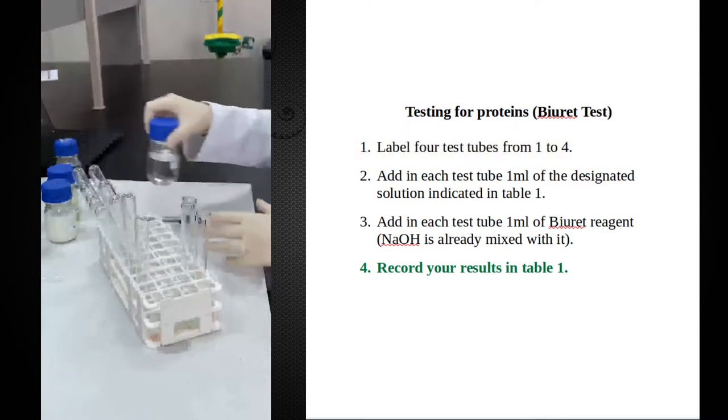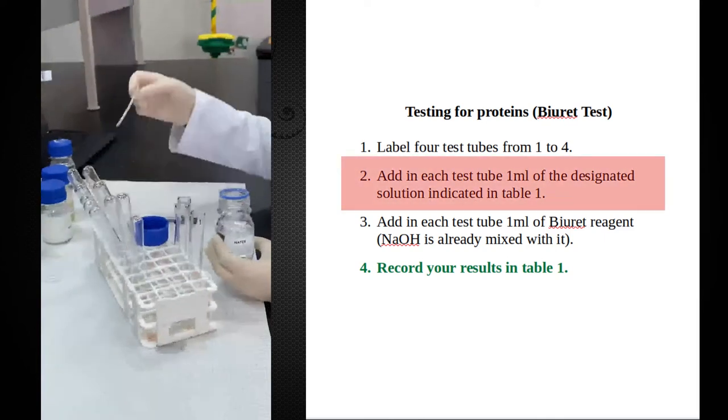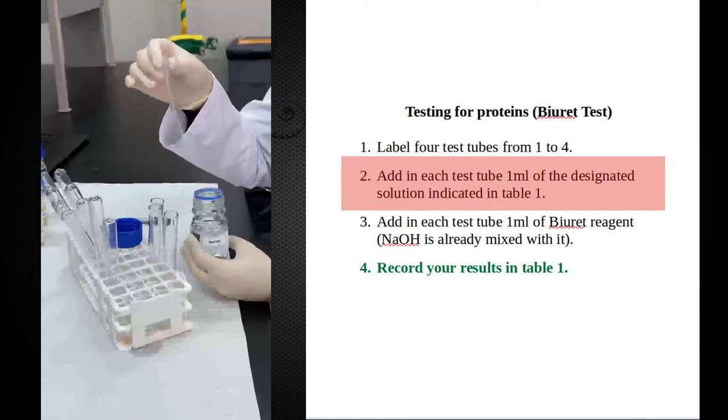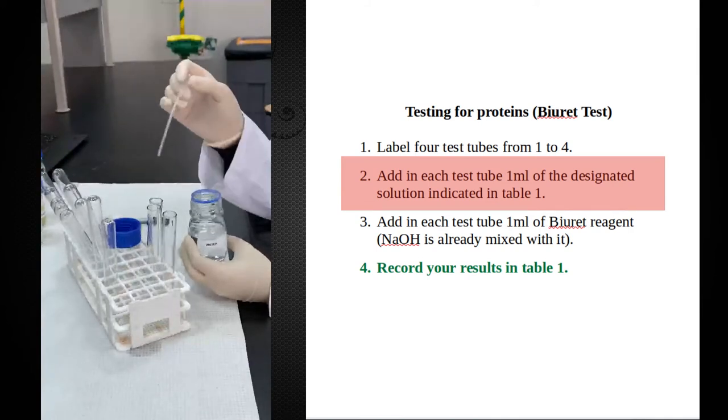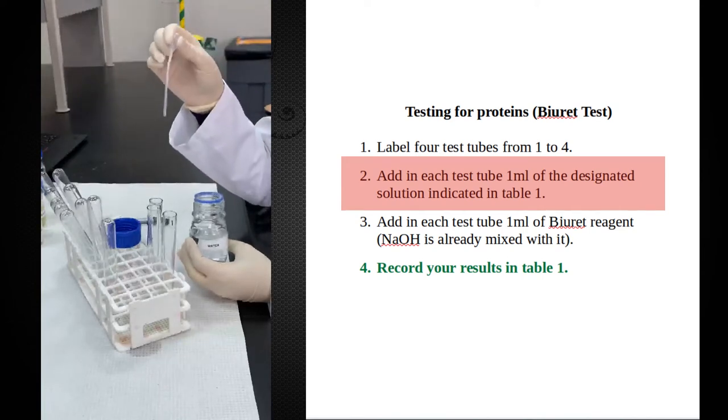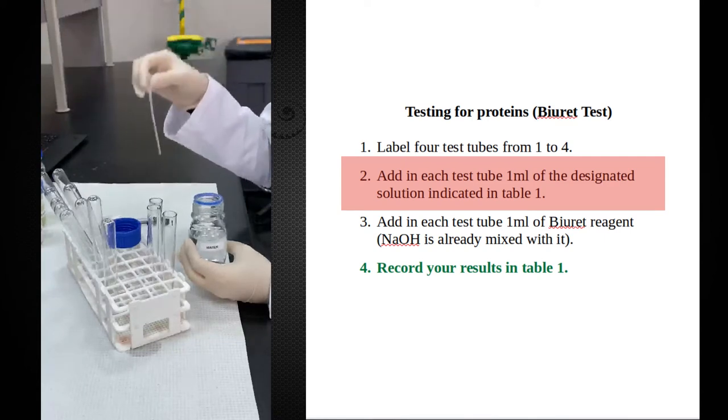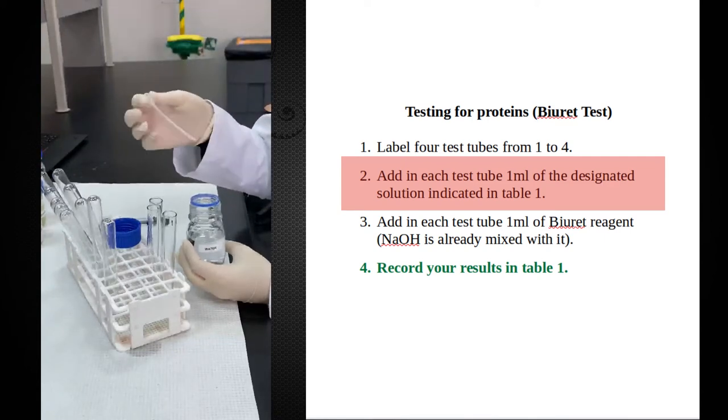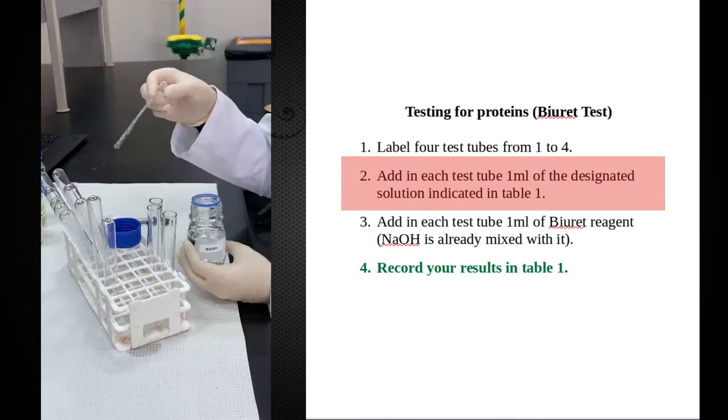In the first test tube, I will add 1 ml of distilled water, and this is my negative control. We are going to use dropper pipettes for this purpose. The most important thing is do not mix up dropper pipettes with each other. For each solution, there is one dropper pipette because we don't want cross-contamination. You cannot transfer one chemical from one place to another. The 1 ml is until the line of this dropper pipette. The amount doesn't have to be very specific, just approximately 1 ml.